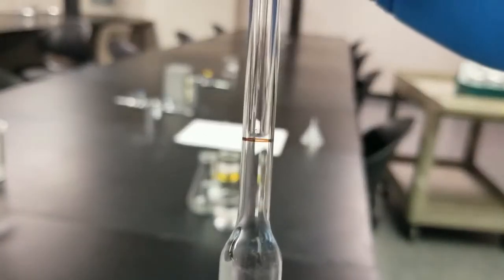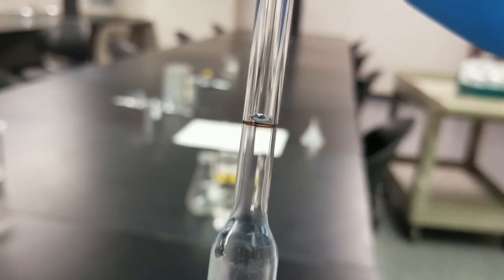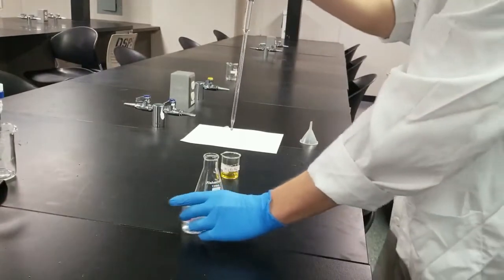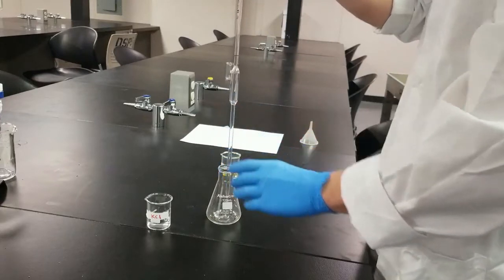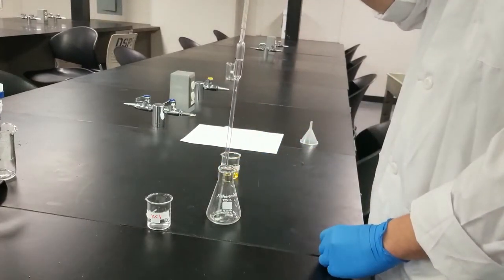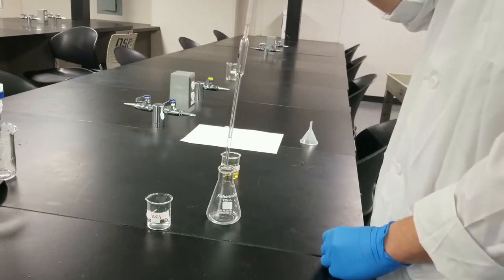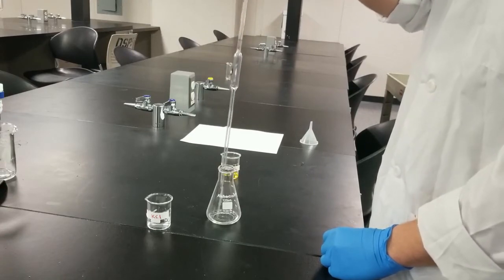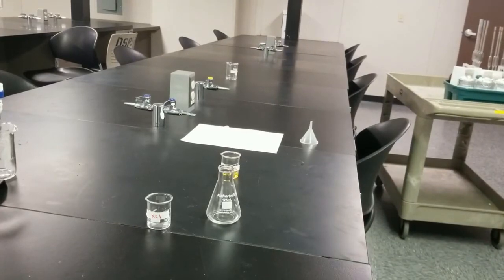So let's check this out. Once it stops bouncing, as you can see, the bottom of my meniscus is right about that 10 ml line. So go ahead and dispense this into my Erlenmeyer. And then according to the lab manual, next thing we want to do is add 15 mils of water.